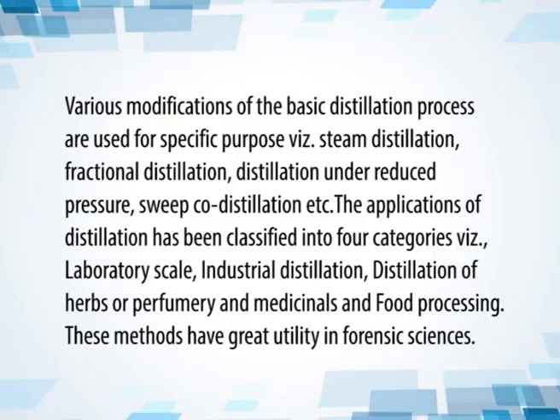Various modifications of the basic distillation process are used for specific purposes such as steam distillation, fractional distillation, distillation under reduced pressure, sweep co-distillation, etc. And the applications of distillation have been classified into 4 categories, which include laboratory scale, industrial distillation, distillation of herbs or perfumery and medicinals, and food processing. These methods have great utility in forensic sciences.